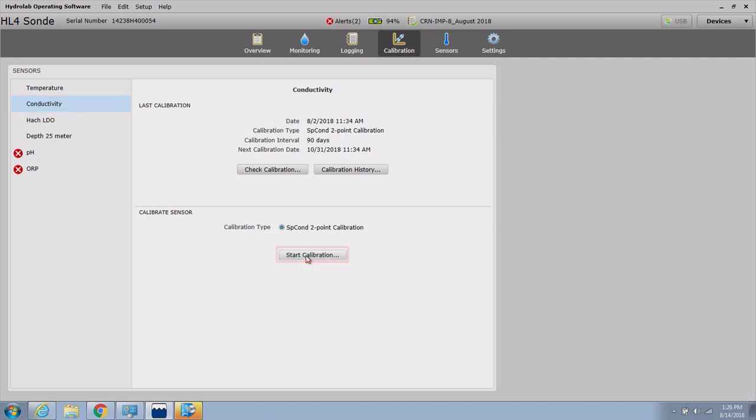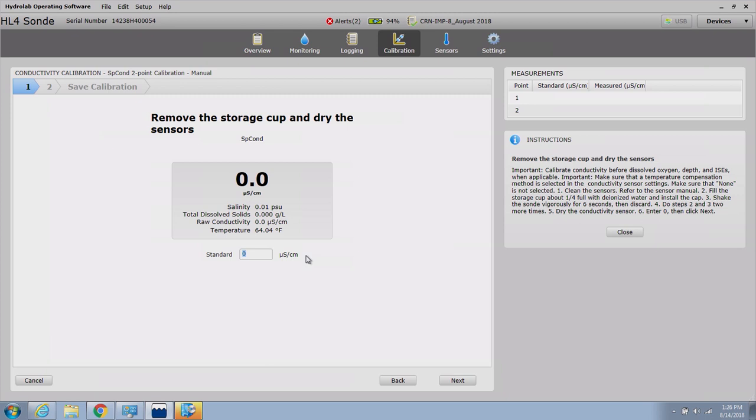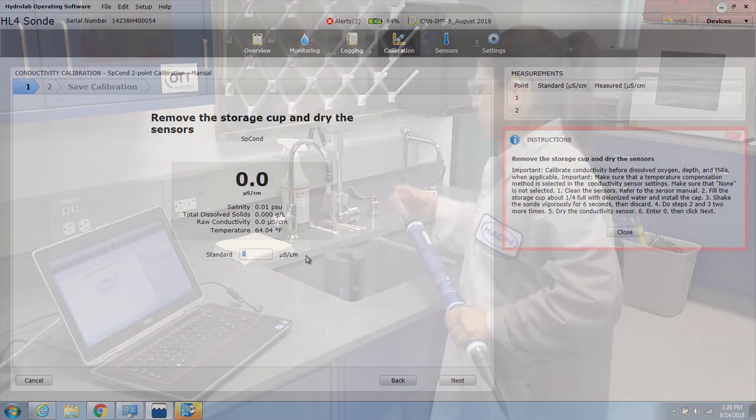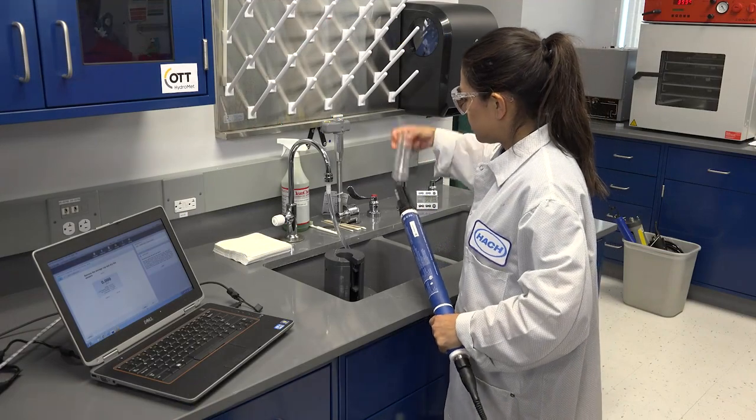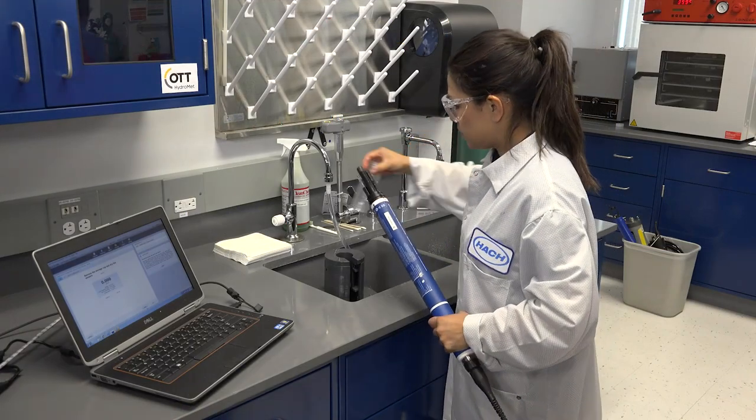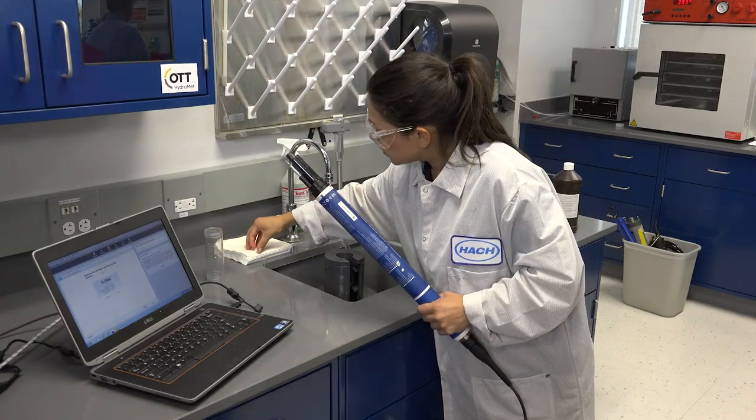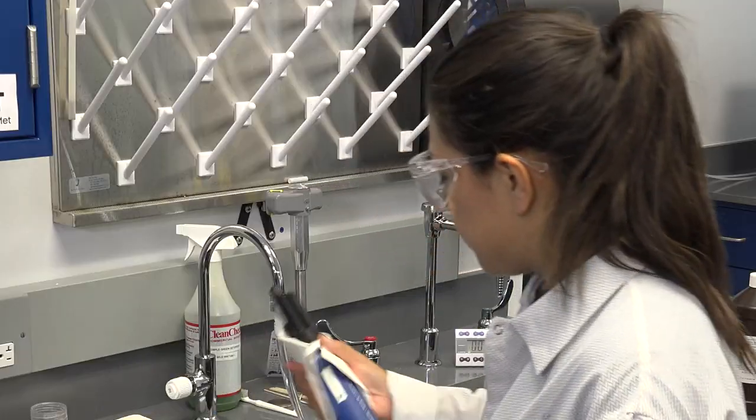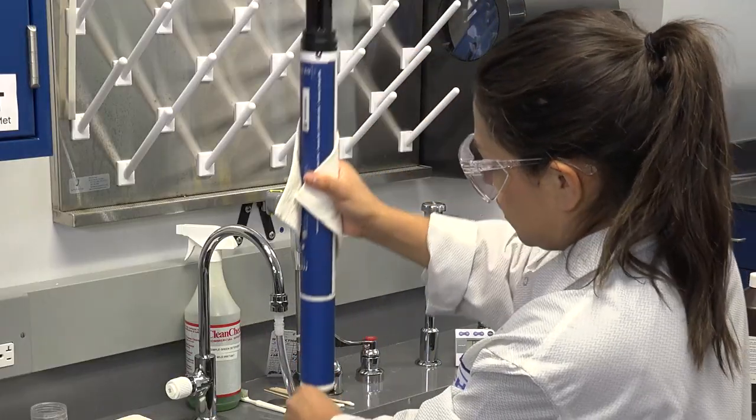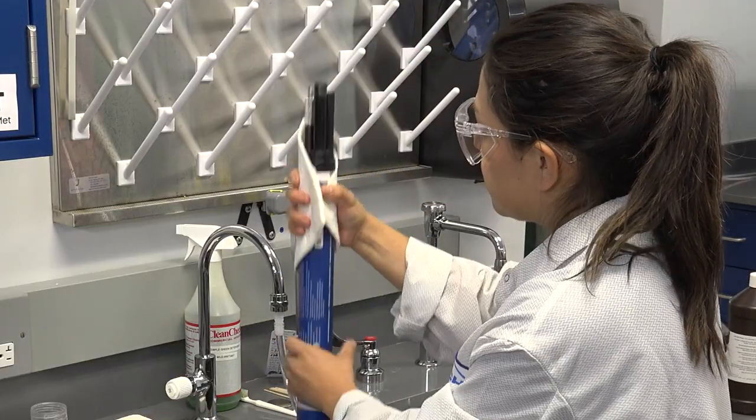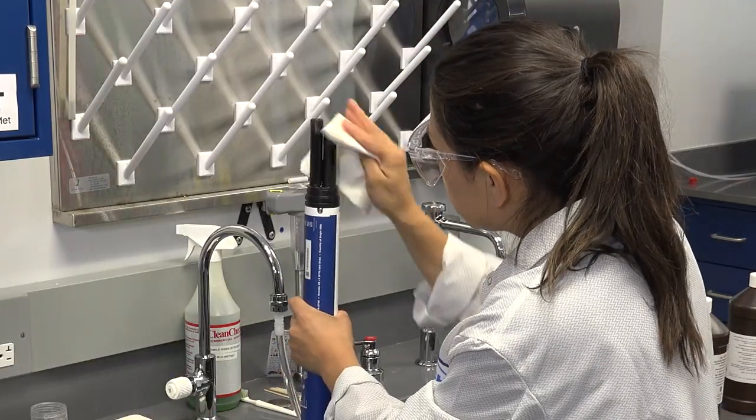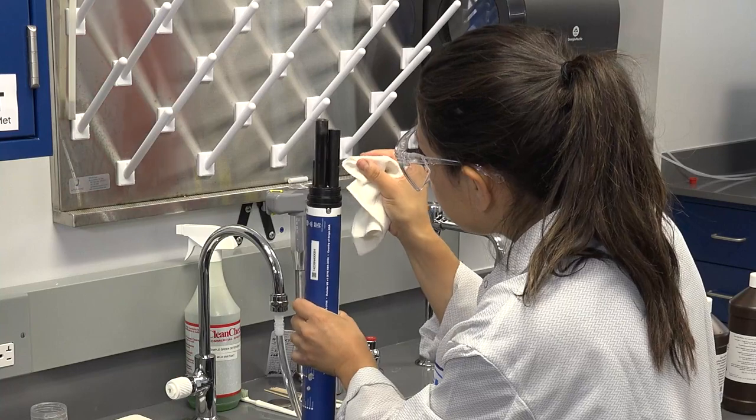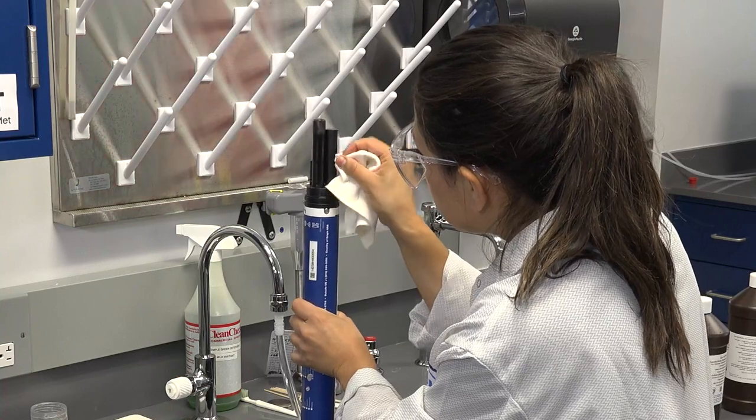Click the Start Calibration button at the bottom to begin the conductivity sensor calibration. For additional guidance, on-screen instructions are available on the right-hand side of the screen. Ensure all sensor maintenance has been performed prior to calibrations. For the first conductivity calibration point, the sensor must be completely dry to achieve the zero reading.